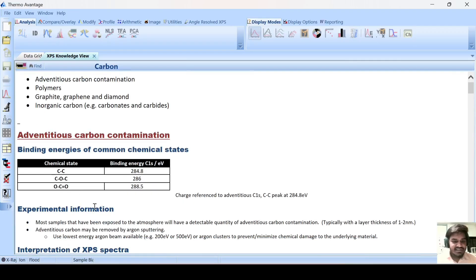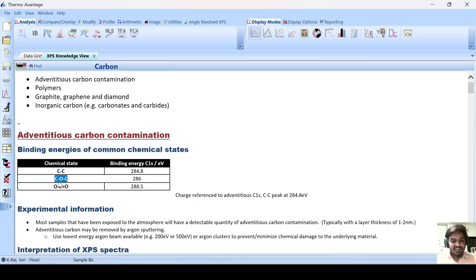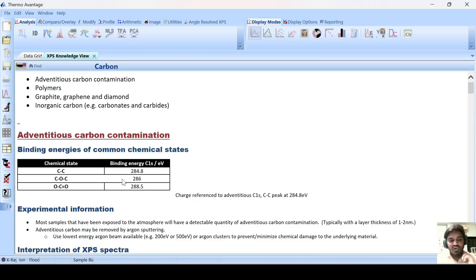Here you can see the binding energy values of the particular oxidation states of carbon. Suppose your carbon is bonded with another carbon — it will appear at 284.8. Suppose your carbon is connected to another oxygen, then it will be 286. Here you can also see zero oxidation state, plus 1, plus 3. So the oxidation state of carbon is increasing, and according to that, binding energy is also increasing.